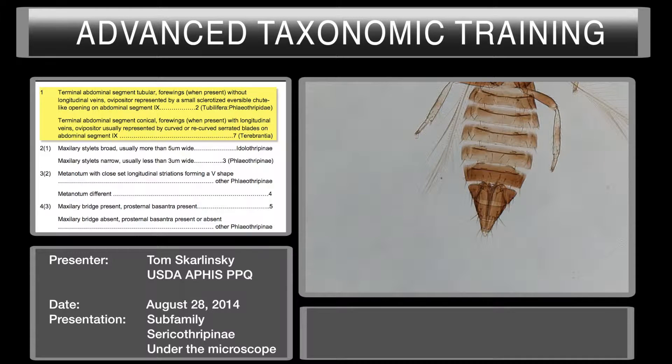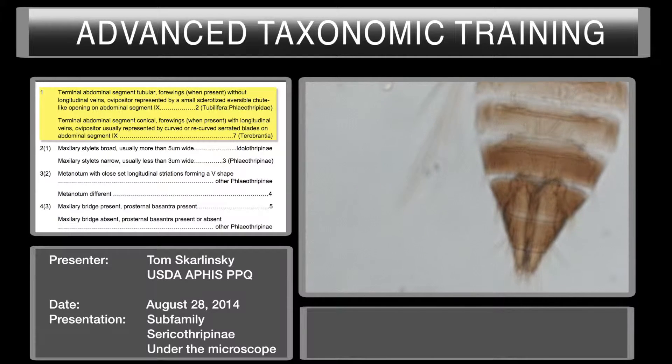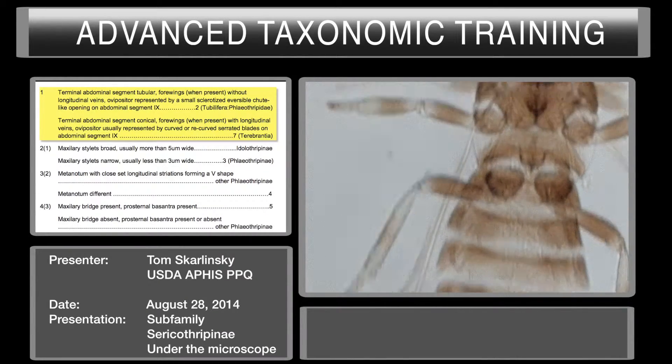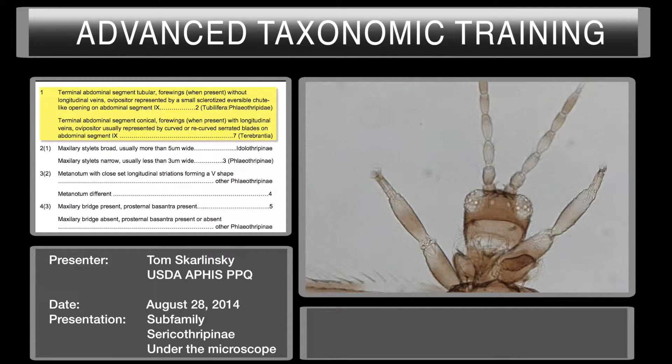Let's go ahead and see if we can see that ovipositor right here. We can go ahead and amp up the magnification a little bit. We can see that it's serrate. So we've effectively eliminated that this is not a Tubulifera — we've got a Terebrantia.